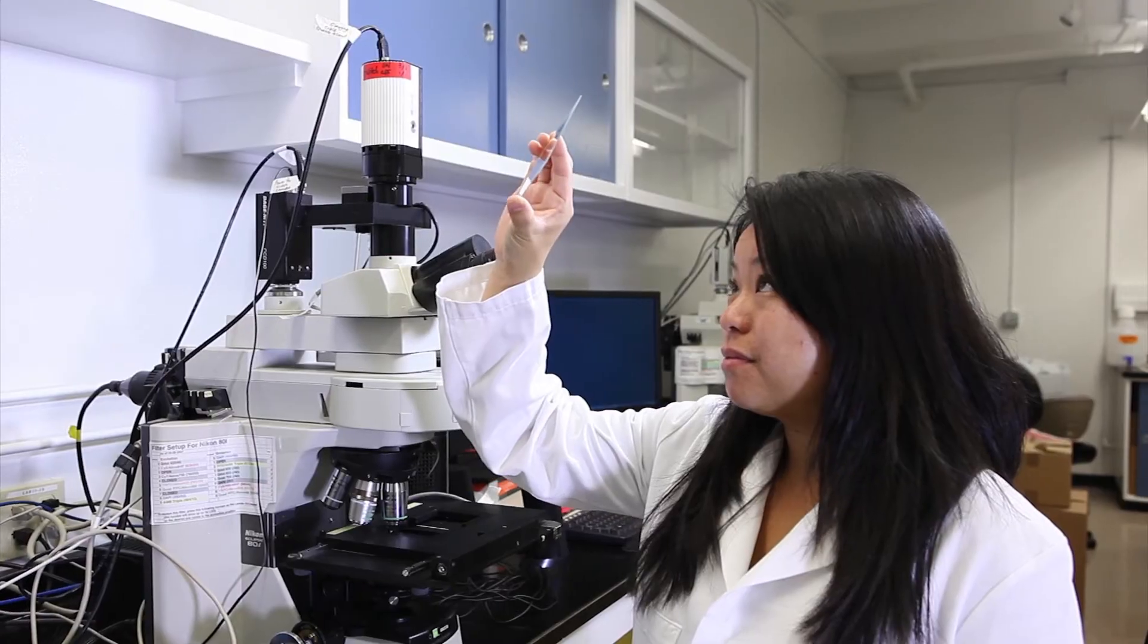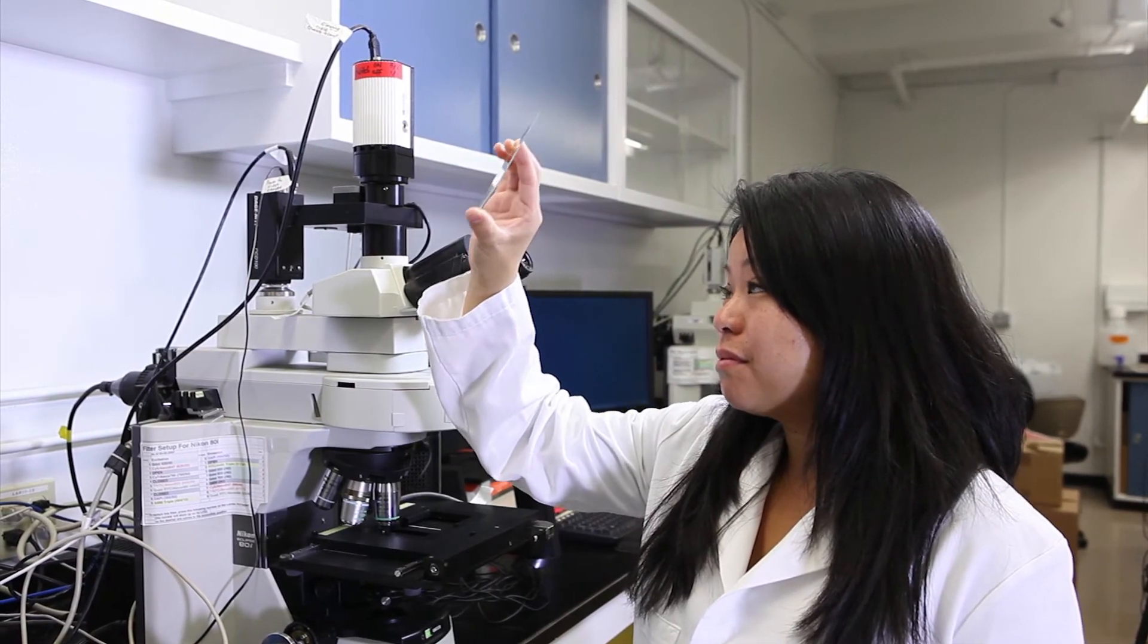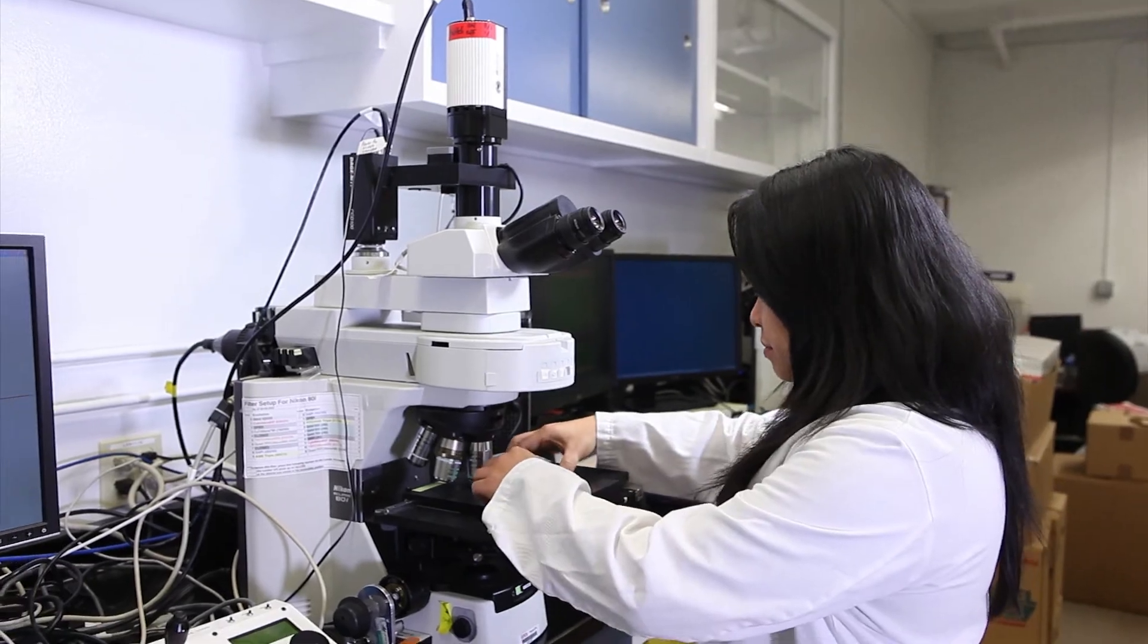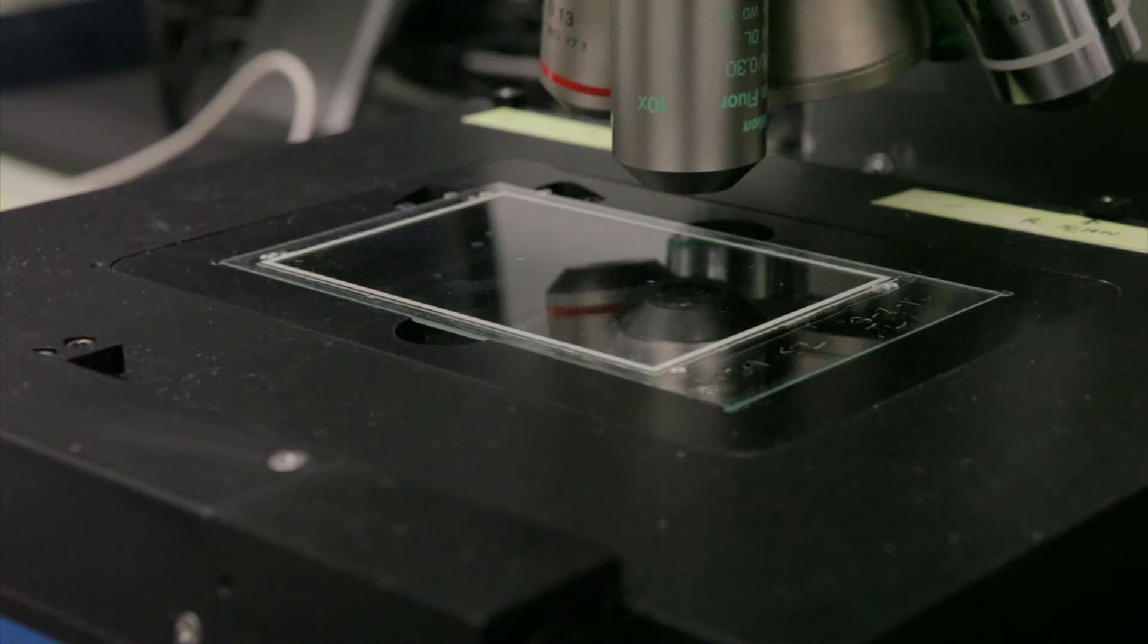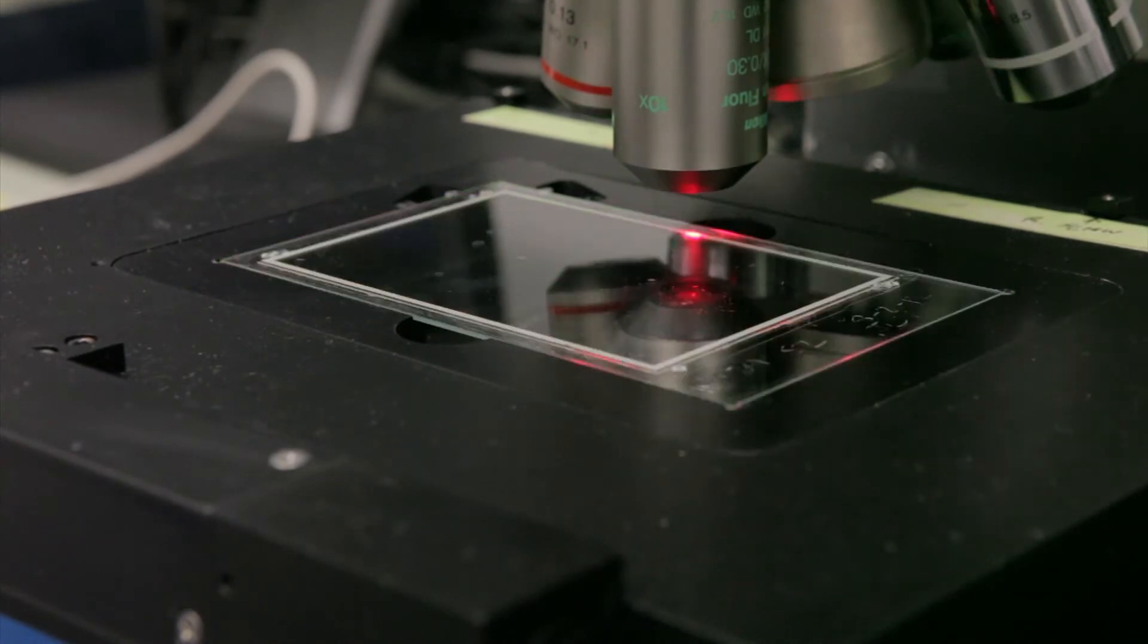The second technology couples with this first technology to then hone in on each individual cancer cell that's identified and to extract critical information from those cells about the patient's disease. We can load the slide onto an automated digital microscope and with this we can take high resolution images, we can zoom in on each of these circulating tumor cells and see specifically the structures each protein biomarker labels.